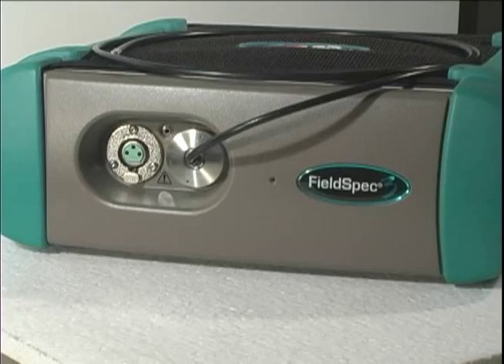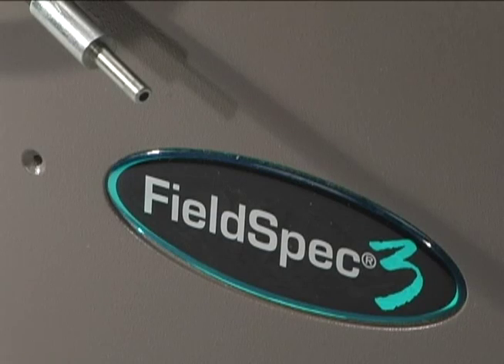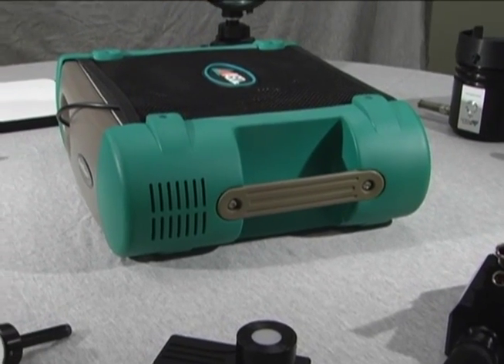One of the things we started out with early on to make things smaller was to use fiber optics to bring the light into the spectrometer. The spectroradiometer instruments use a permanent fiber optic cable to maximize the signal throughput — to maximize the amount of light going into the instrument. That has been in every instrument through the whole development over the last 20 years, and it has allowed great flexibility. It also allows us to radiometrically calibrate the instruments so the customer can collect in either radiance or irradiance units of energy.